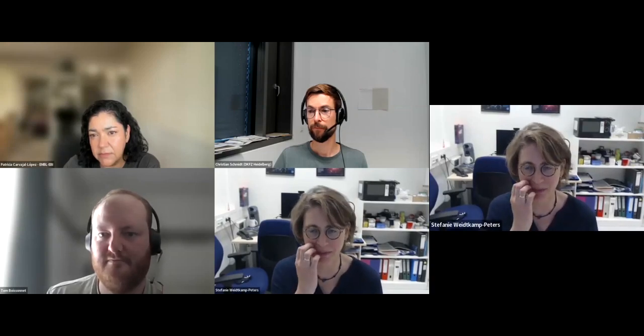Thank you. I'm going to jump a bit to the last question because it's related to REMBI. When do you introduce the concepts of REMBI, etc., before or after the microscope introduction? So principal investigators need to be on board. What we do in our core facility, so that's really local in Düsseldorf, but I know it's similar in other places, is that people get microscopy introduction, and then they are invited also to get the introduction to OMERO and to have a meeting with one of the local data stewards, and then they are introduced to REMBI.